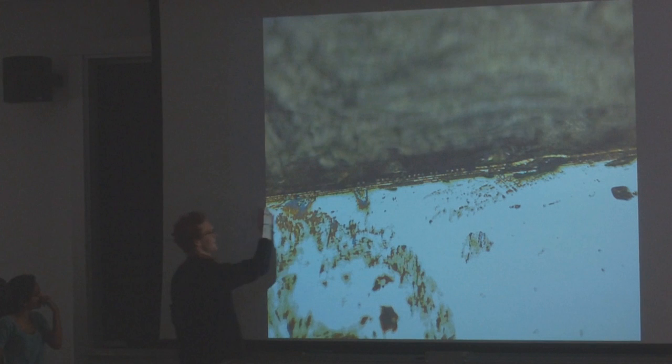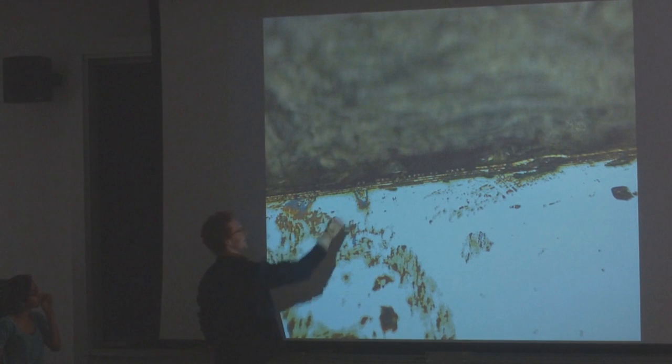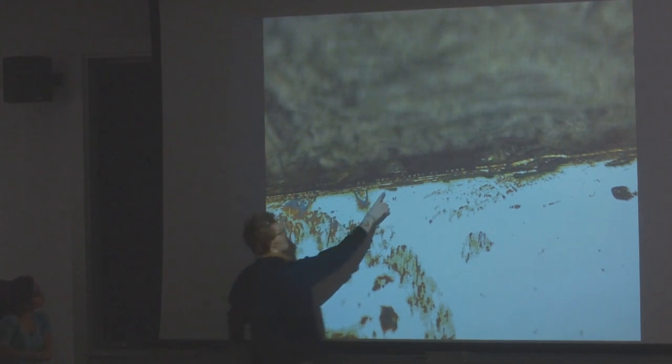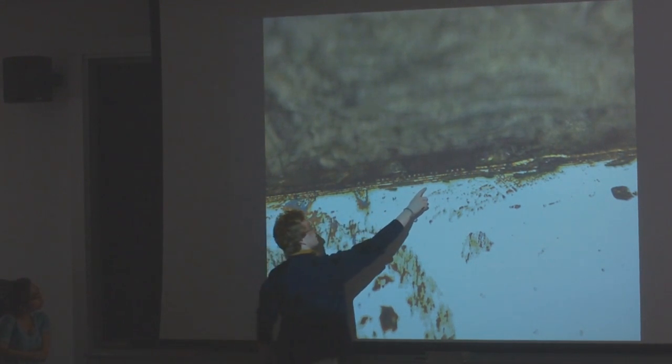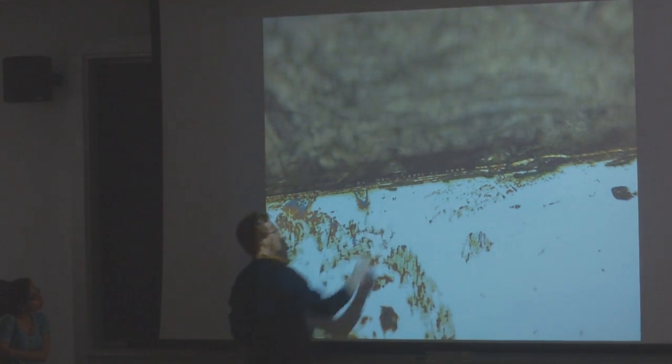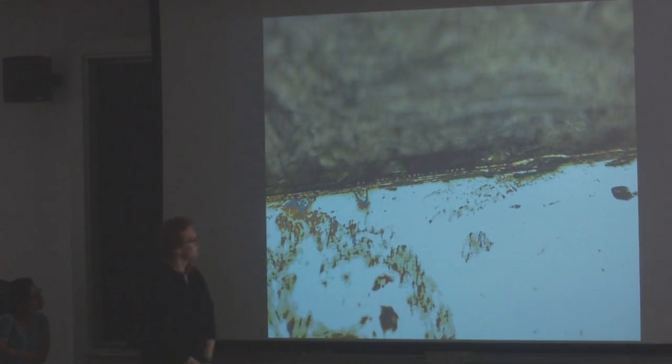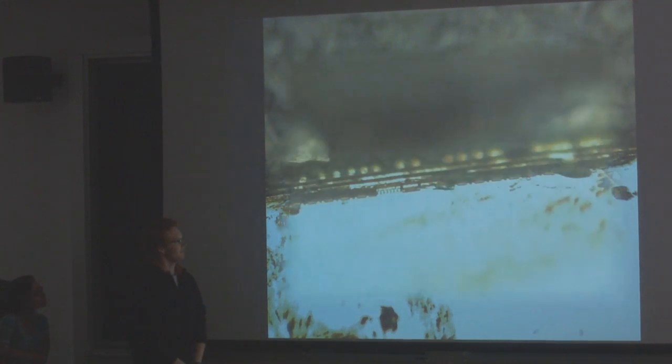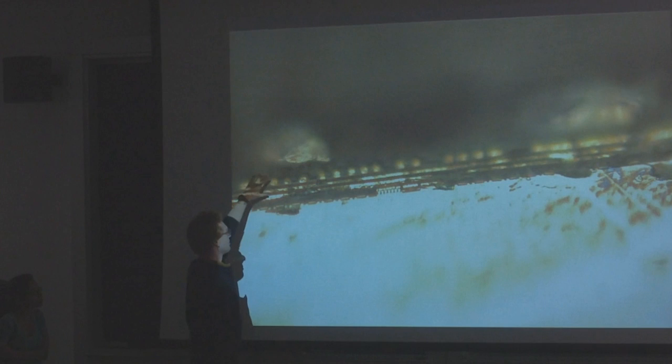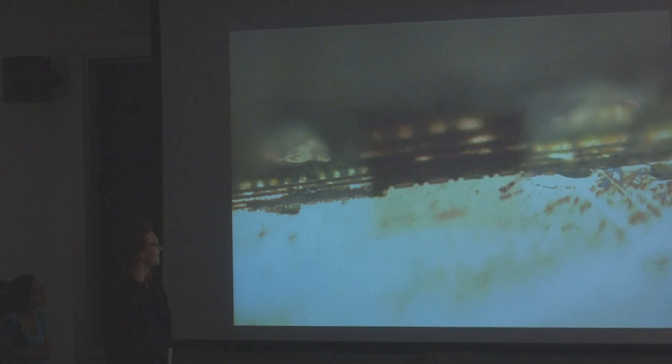If you go in again, you start to see there's actually stuff there. You can see these lines of wiring, and then you start to see some patterns on the edge of the silicon. If you go in again, this is where you get to see some really exciting stuff happening.